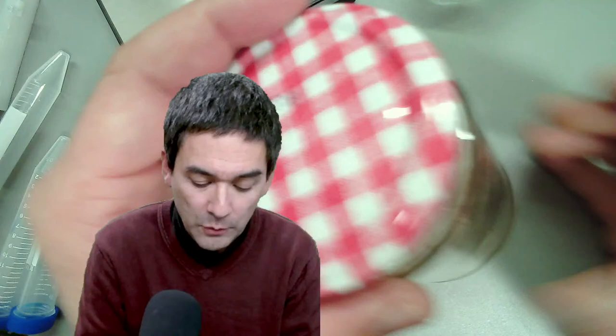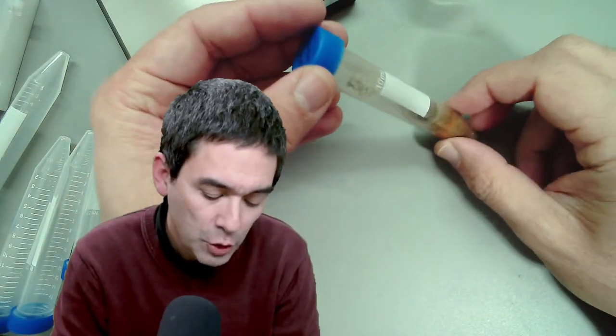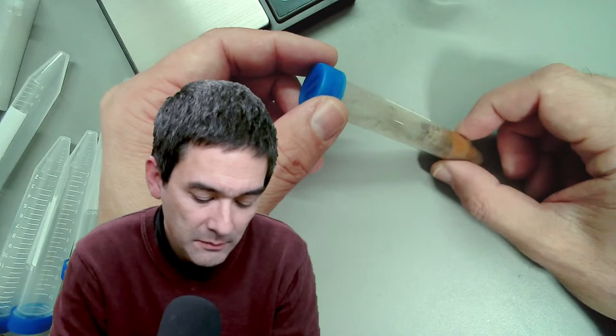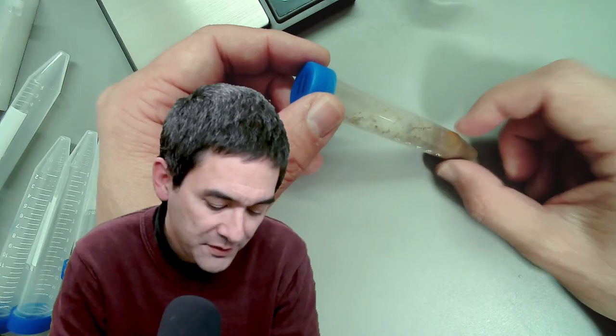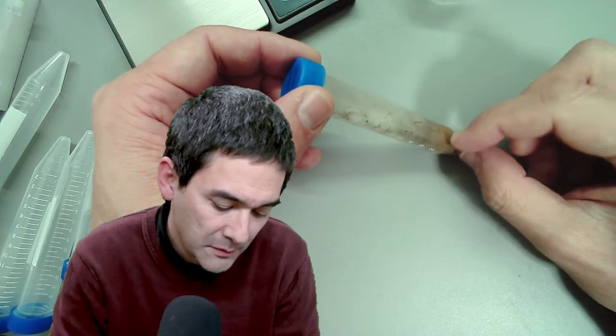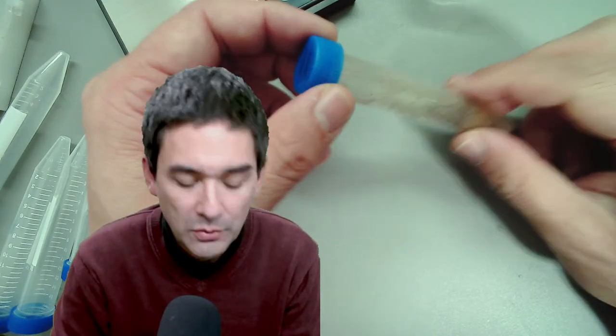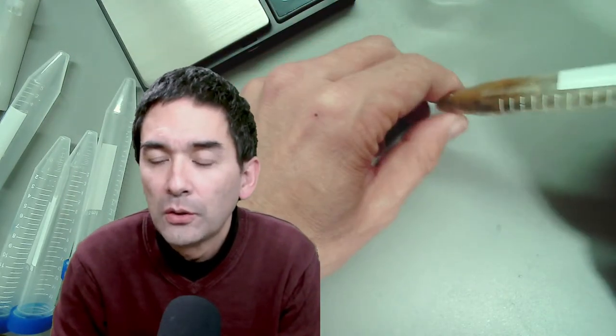Over here I have another water sample with some algae I would like to concentrate. I've got my favorite drink — I'm going to centrifuge a coffee, which is also quite interesting. And here I've got a sand sample from a beach in northern Germany — the Wadden Sea — collected several months ago. I would like to extract some of the diatoms from it. Those are going to be my four samples.